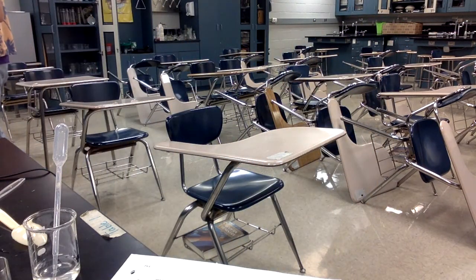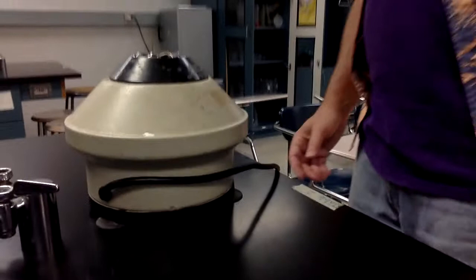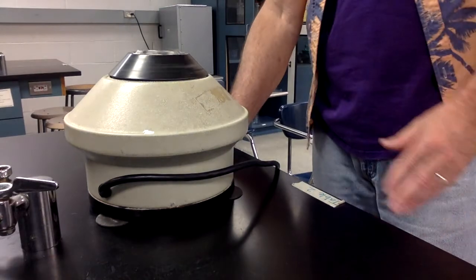Centrifuge has up to 6 slots available. Everything is labeled, so should not be an issue of anything being misidentified. So now we're back to centrifuging. Hit the button. Make sure she doesn't walk on me.